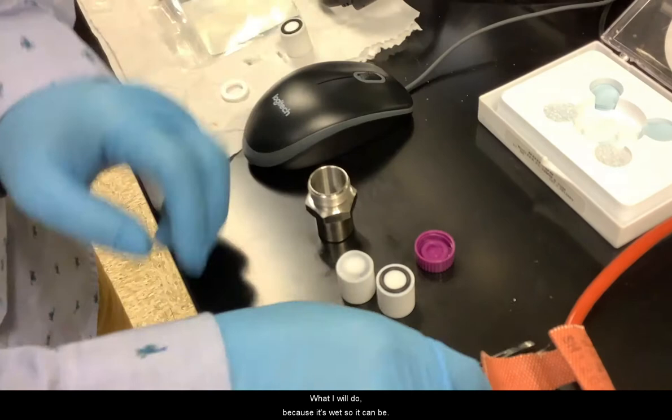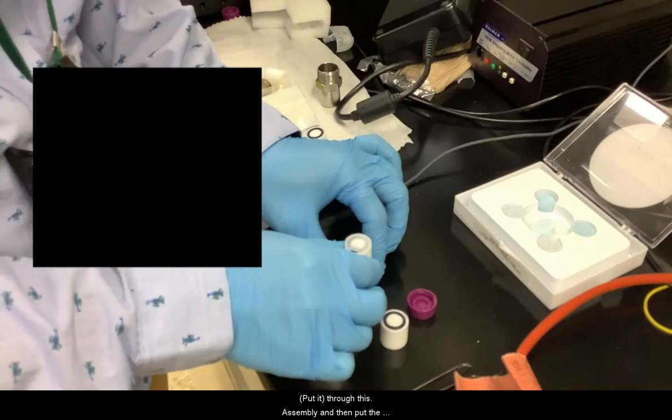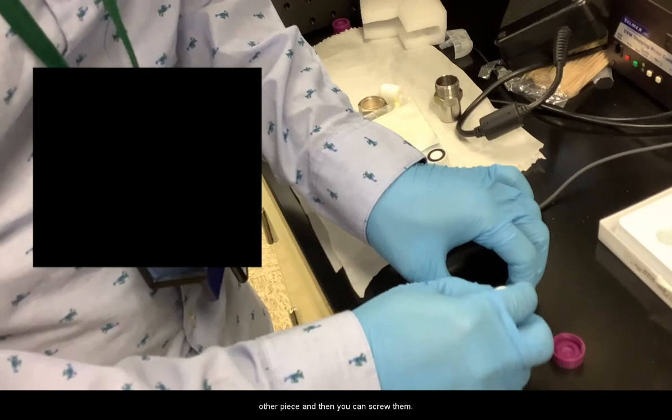On the other side, you put those two spacers to the other block. Then what I do, because it's wet, you push this a little bit and it will be touched better. Then I put that through this assembly and put the other piece on.